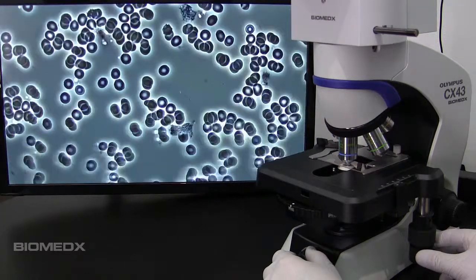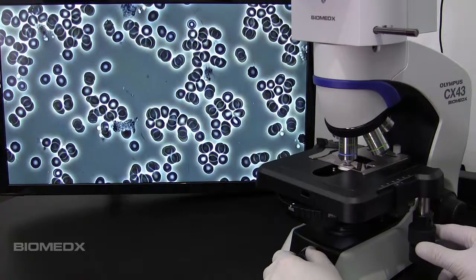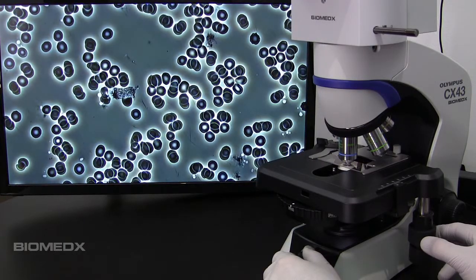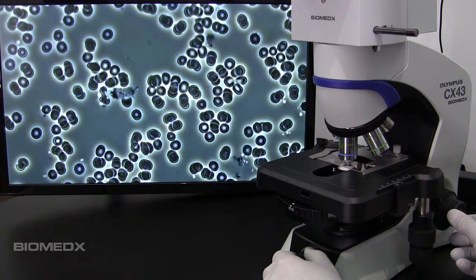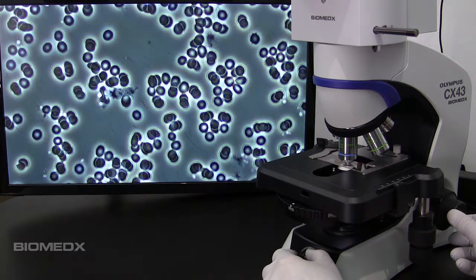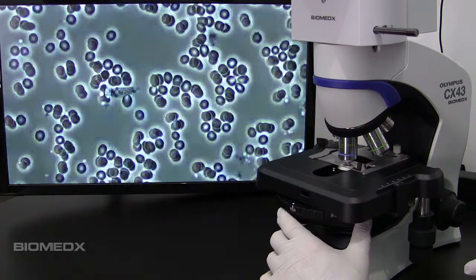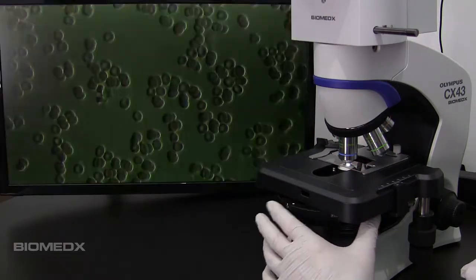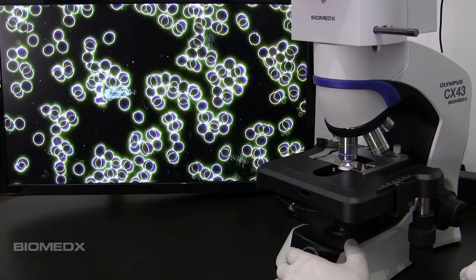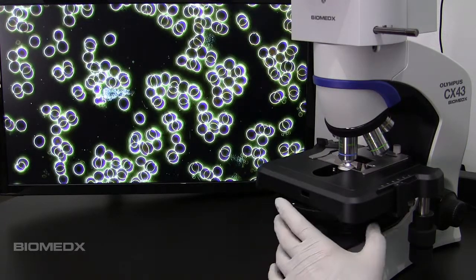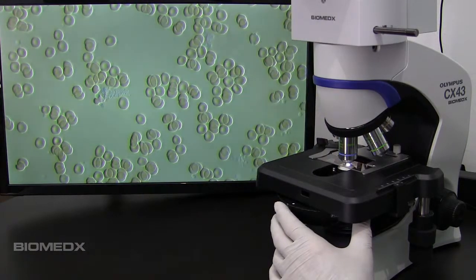One thing that you might also notice as I move the specimen around is the image is hardly blurring as it moves. Our camera is doing 60 frames per second with a very fast exposure shutter. There are a lot of microscopes being sold for this business that have a USB style camera that plugs into a computer and then an adapter might be used to go to an HDTV. Tried a lot of those cameras and they just didn't look so good. There is no comparison to what you are looking at here.